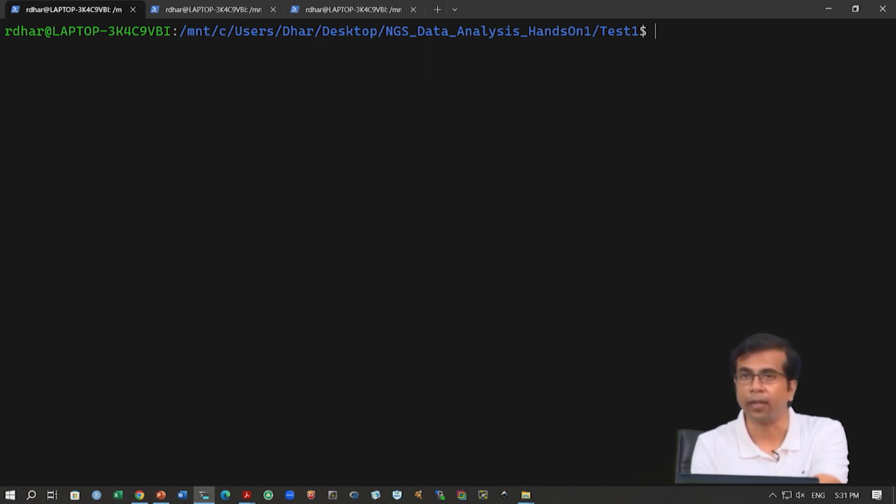If you are familiar with Linux, you will know this: there is a way to do this by adding it to the path. Okay. If you want to add this to the path, you need to have administrative access, meaning sudo access, and you have to modify the file which we will call bash profile.